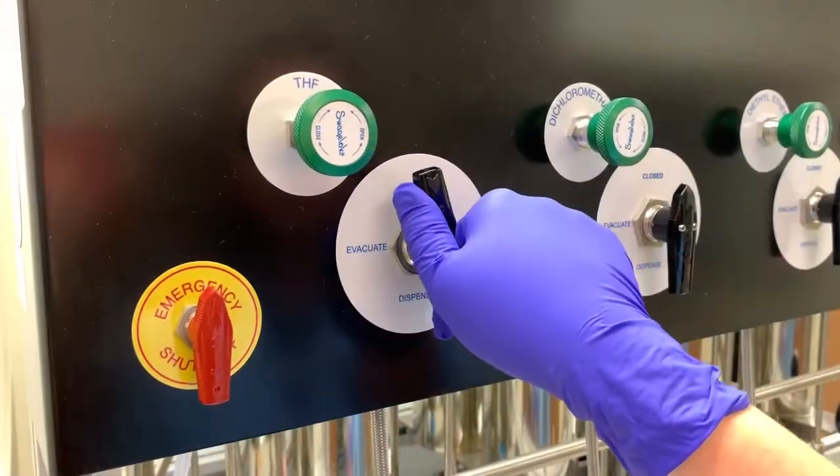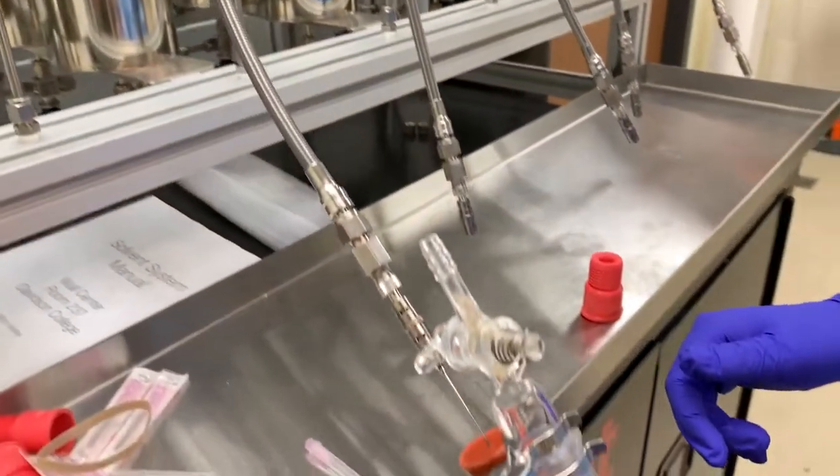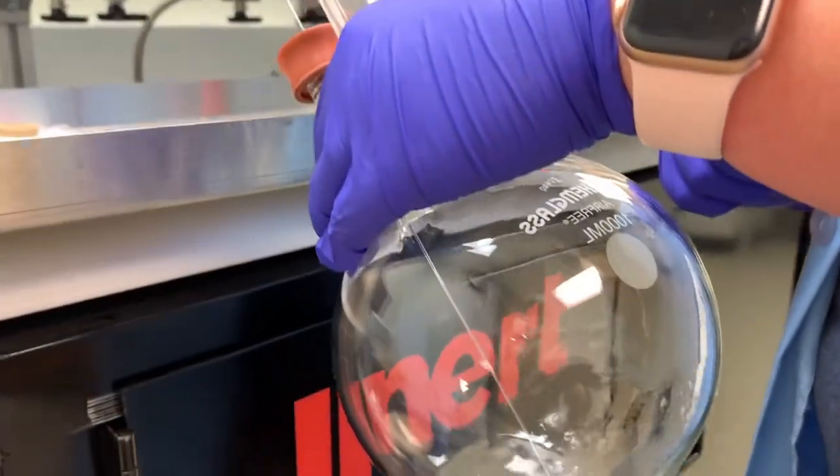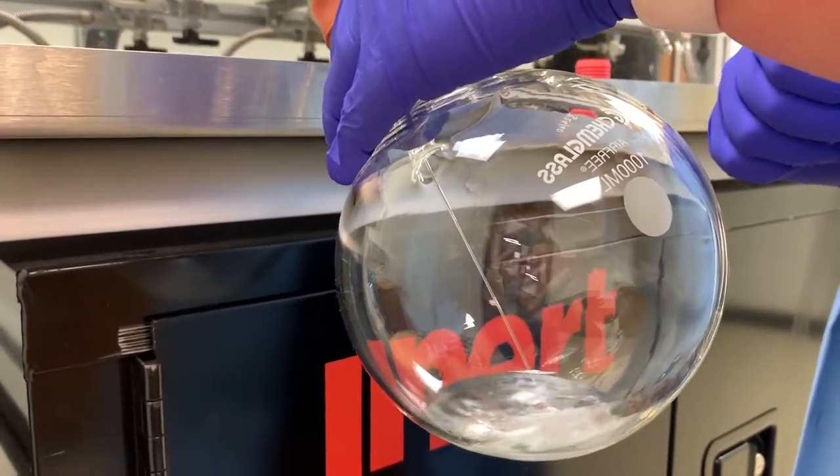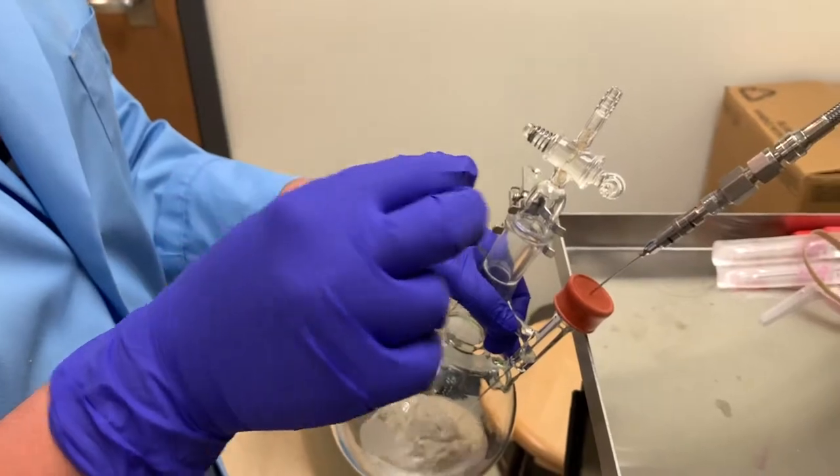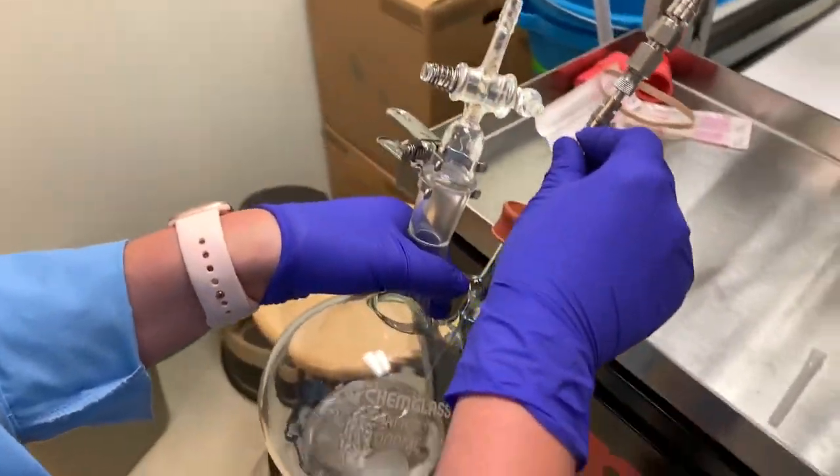At this point, do another clockwise turn of the valve to dispense. Liquid should begin flowing. If not, there is a green knob near the black valve that might need to be opened. If there is still no liquid, you can hear gas flowing, then the still might be empty.